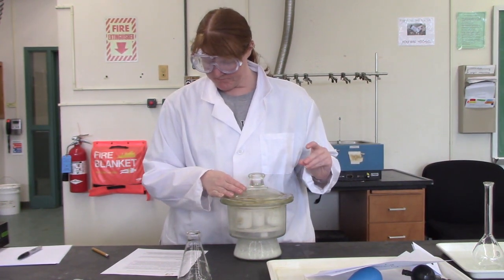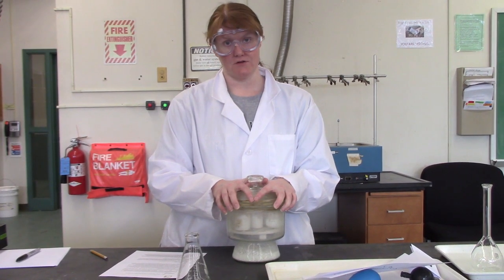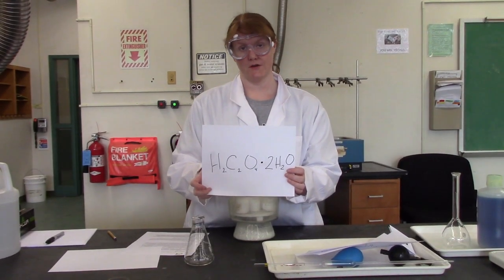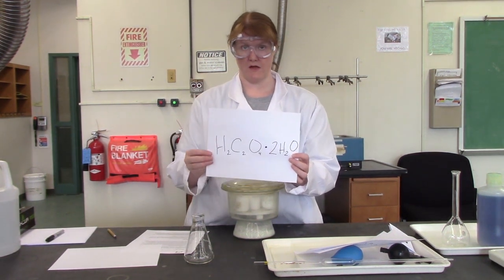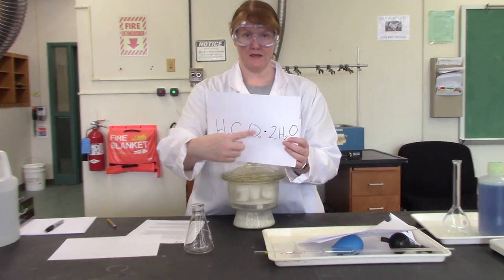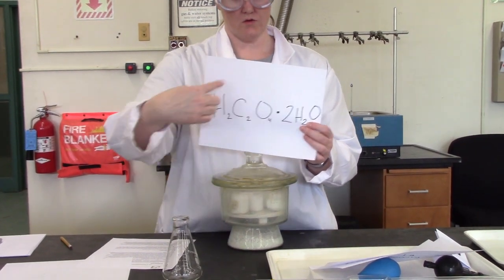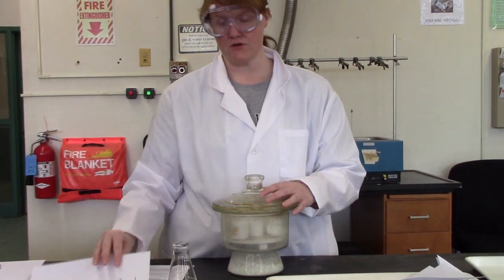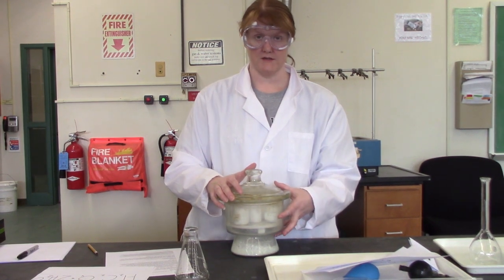Now, in your pre-lab, you should have calculated how much oxalic acid dihydrate to add. When you figure out the amount of oxalic acid dihydrate to weigh out, you need to include the weight of the water. Don't forget that. It's part of the crystal structure. The dot does not mean multiply. It means that every piece of oxalic acid has two waters stuck to it. So the total formula weight is all of these added together. We want to make sure that it stays dihydrate and doesn't absorb any other water. In order to do that, we store it in a desiccator.